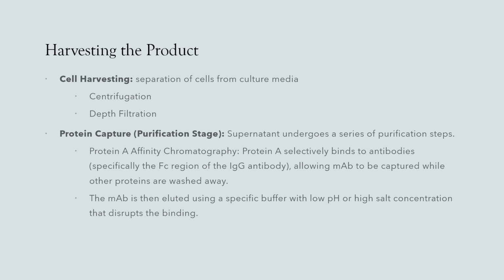And then you change the mobile phase, or the eluent, to a specific buffer, low pH, high salt concentration, that disrupts that binding between the protein A and your antibody, enabling you to capture the pure antibody, or at least the free antibodies, in a purer state.